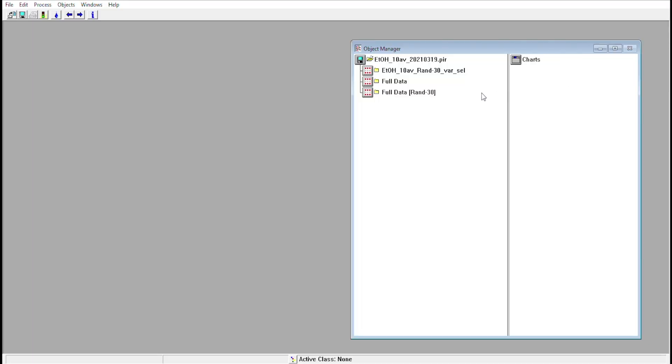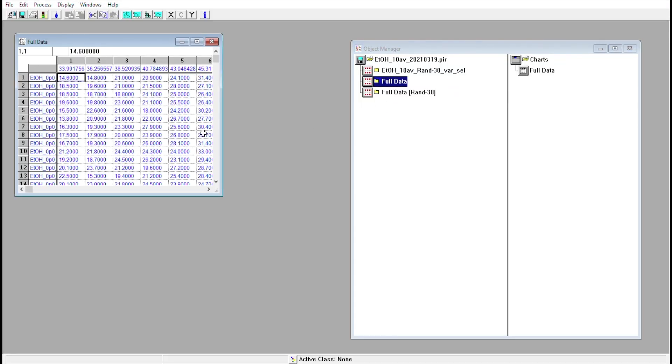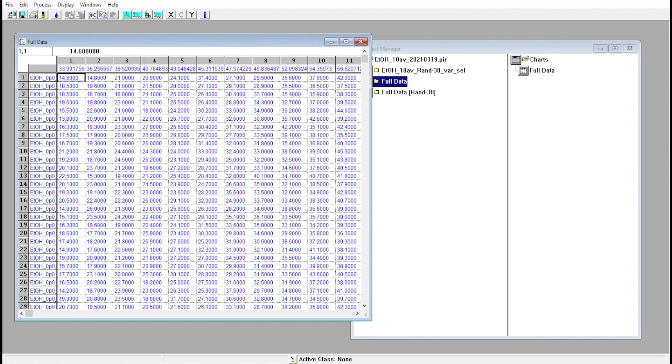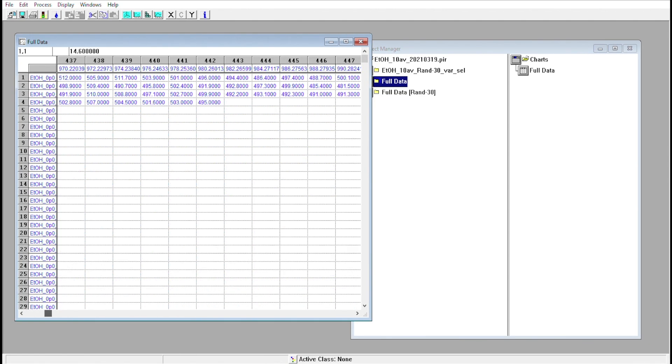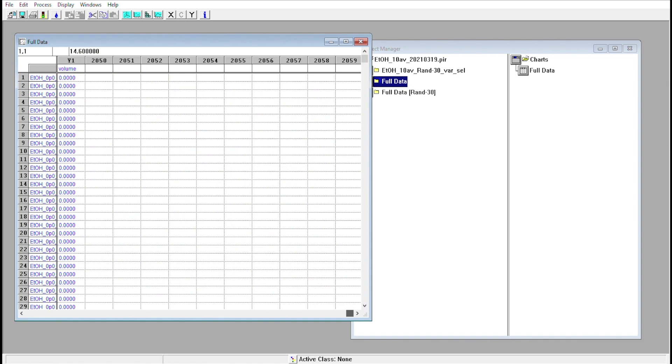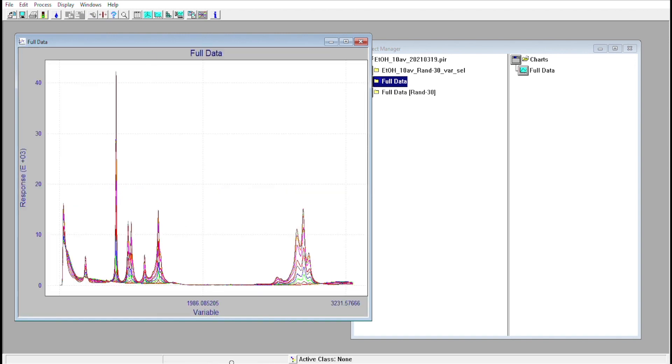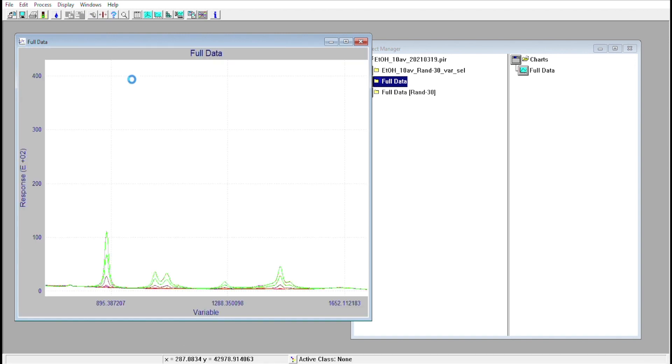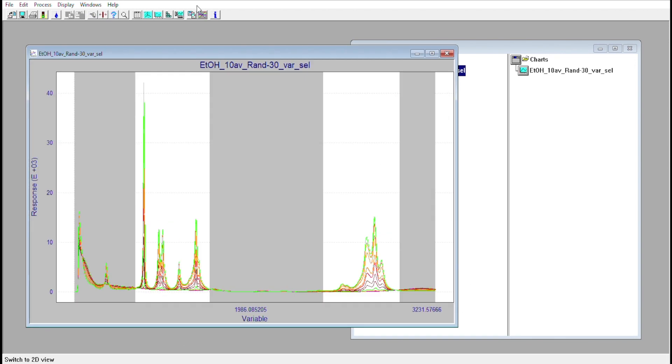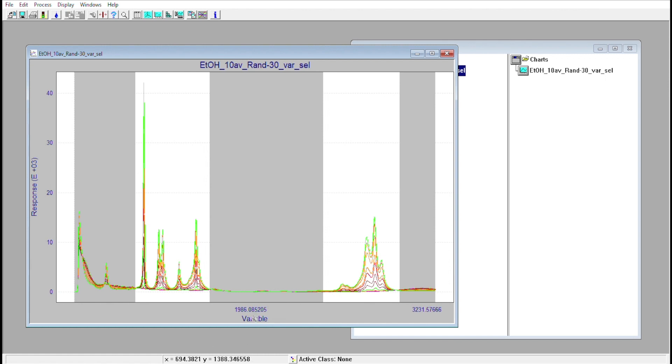Step two is building and validating the model. We used chemometrics modeling software to build our quantitative models. For this video in particular, we used Infometrics multivariate data analysis software Pirouette to build a simple, linear quantitative model using our ethanol calibration samples.